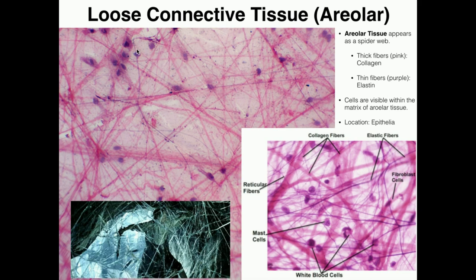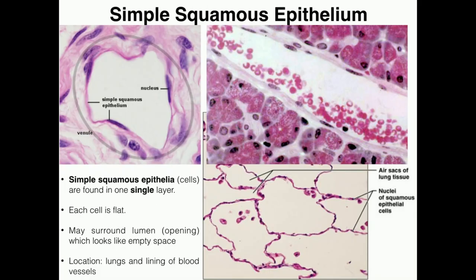You also see these much thinner purple fibers — here's one going up and down, and there's another one in the bottom right corner. Those are elastic fibers, also called elastin. The whole thing just looks like a spider web. You also have cells in here — here's a mast cell, which is a type of immune cell, and also other white blood cells. All these cells collectively your book calls interstitial cells. So there are a few things to know: that it's areolar or loose connective tissue, being able to recognize collagen fibers, elastic fibers, and the interstitial cells throughout the tissue. You're typically going to find loose connective tissue under many kinds of epithelial tissue.